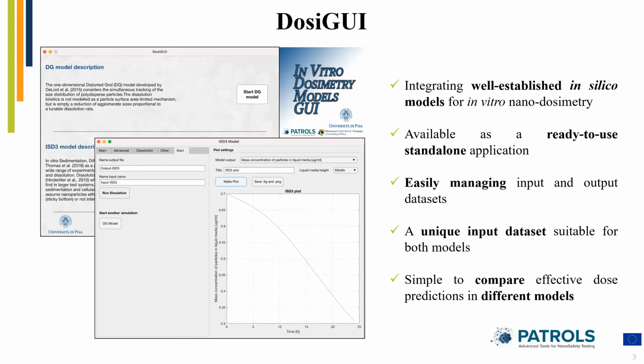In this perspective, and with the aim of encouraging and possibly widespreading the utilization of in silico models in the field of nanotoxicology, which, despite their predictive potential, are almost unexploited, since they first of all require the full installation of a licensed computing environment, which is MATLAB, and which also requires the user to have a basic programming knowledge for editing their source code to manage the input and output datasets.